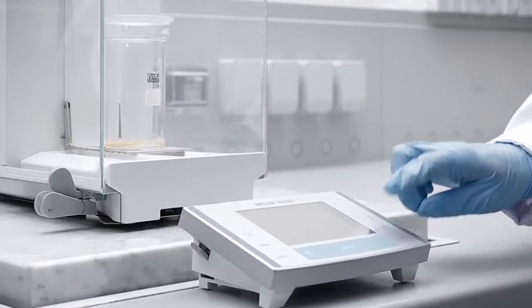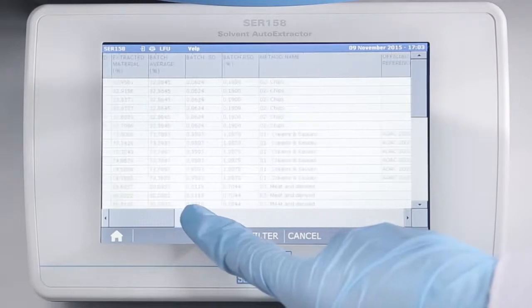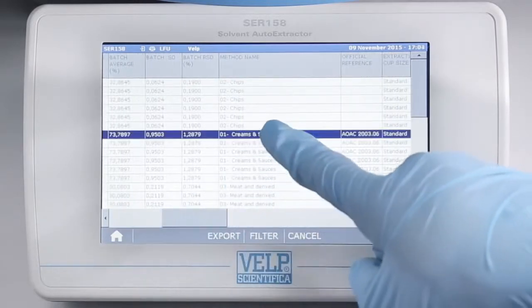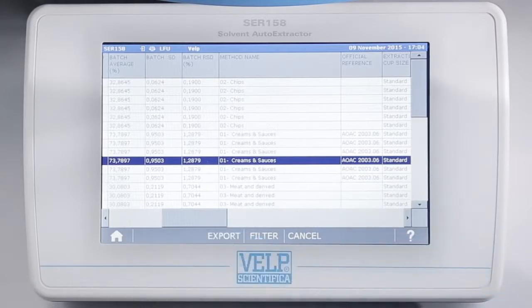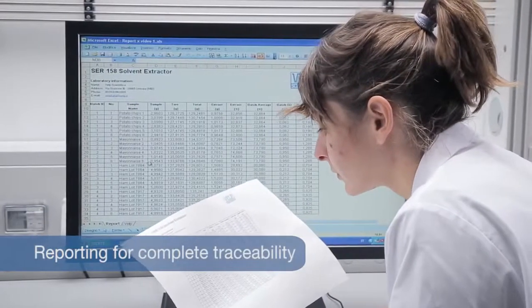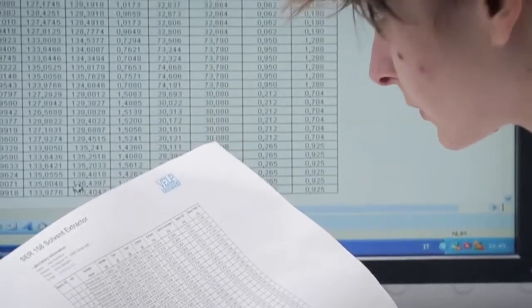Analysis results are calculated automatically and stored in the control pad. Thanks to this unique feature, analysis data can be downloaded directly to your PC for maximum flexibility of data management.